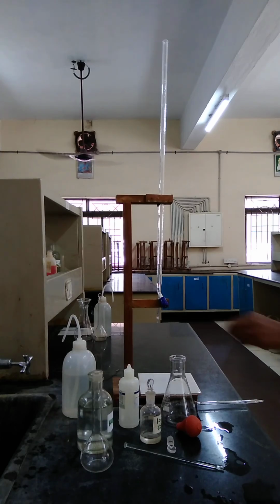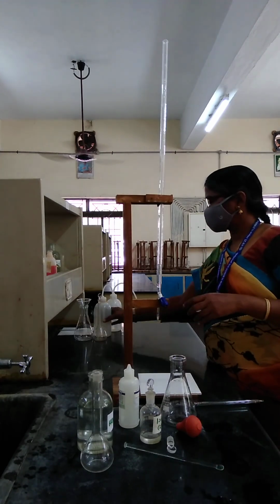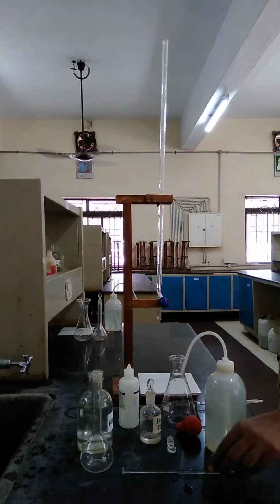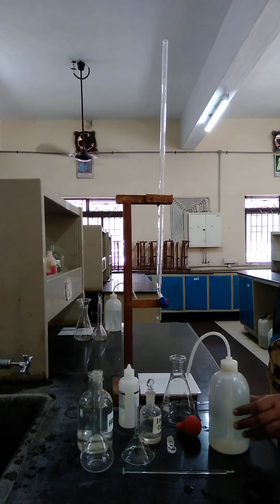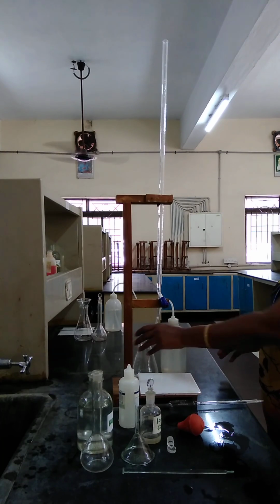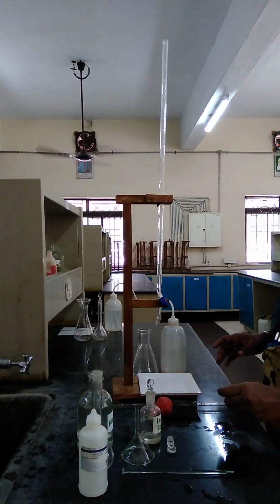Good afternoon, day 7. We are going to do the first experiment. As per our syllabus, you know already the first experiment name is estimation of HCl, hydrochloric acid, using standard oxalic acid. Okay. So for the first experiment, we need to know about the makeup sample.